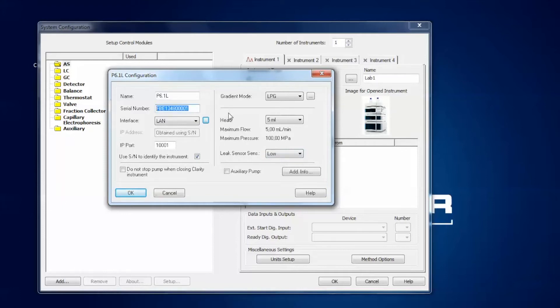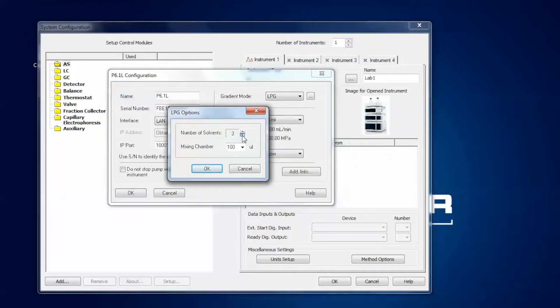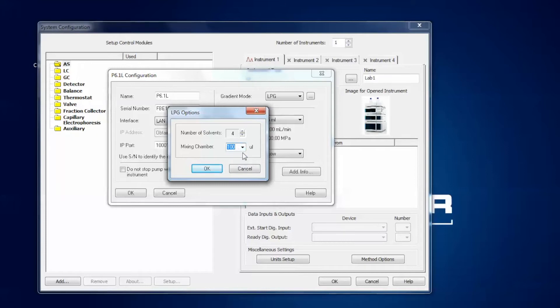You get the serial number and the software recognizes the gradient mode of the pump — this is an LPG pump. It also recognizes the size of the installed pump head. For an LPG pump it is important that you can change the number of used solvents and the volume of the mixing chamber. This is important since the mixing chamber is not automatically recognized by the software. So if you changed, for example, a 100 µL mixing chamber for a 200 µL one, you have to adjust this here and press OK to confirm.